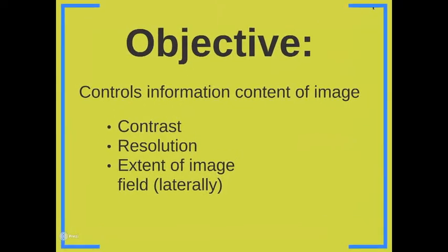Last but not least is the objective. This is an important consideration because it controls the information content of the image. The design of the objective determines the contrast and the resolution of the image, as well as the lateral extent of the image field in the microscope's view.